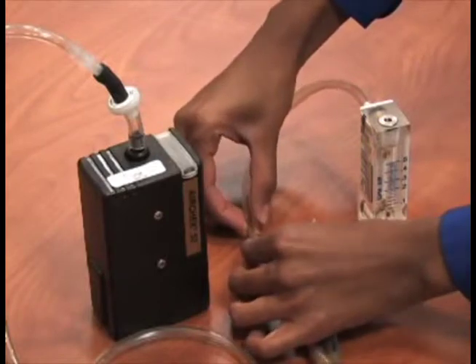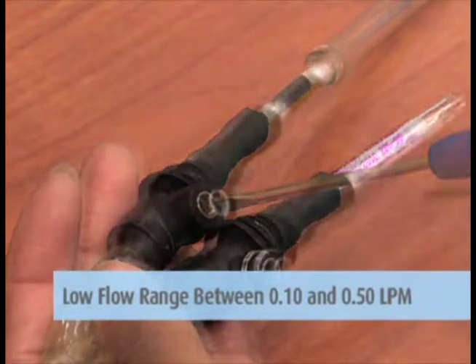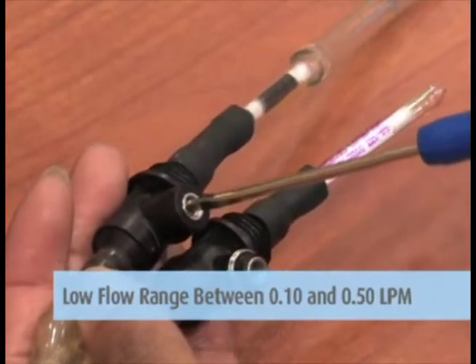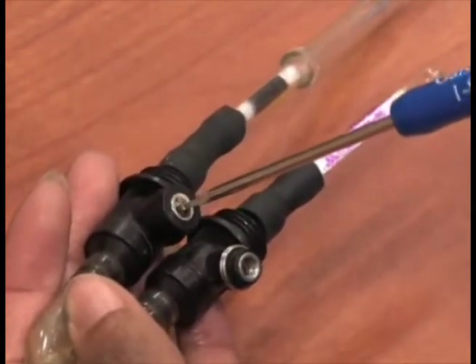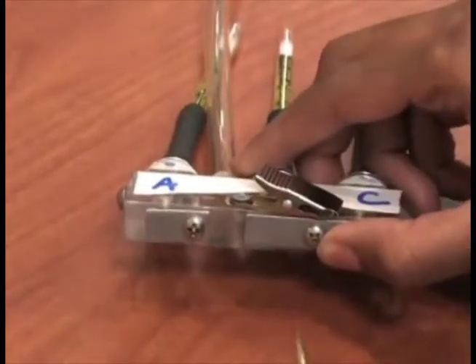Connect the rotometer to the exposed end of the sorbent tube. The adjustable low flow holder allows flow adjustments in the low flow range between 0.10 and 0.50 liters per minute. Do not adjust the pump itself at any time while verifying calibrations — only the low flow holder should be adjusted.